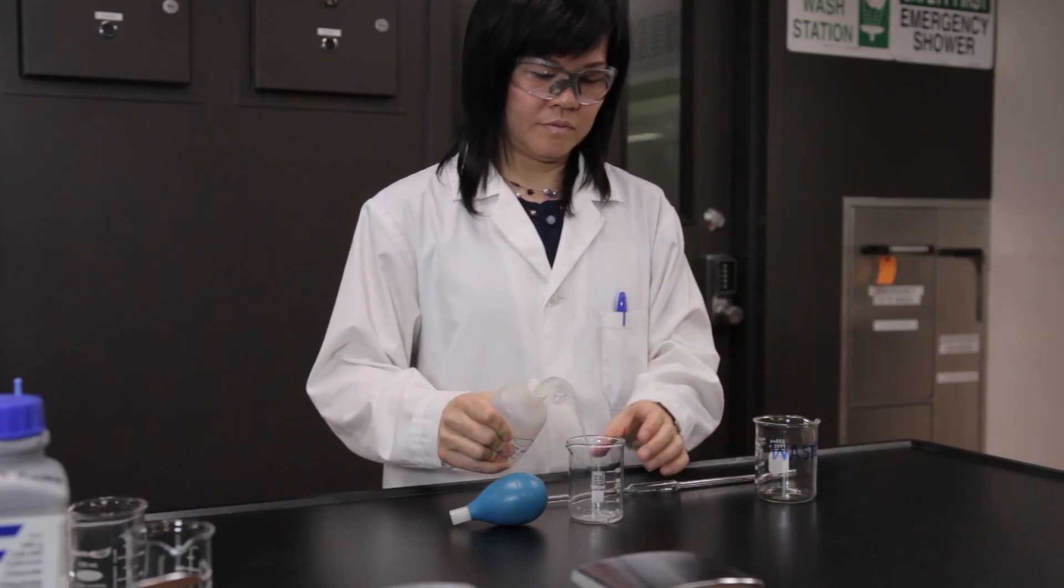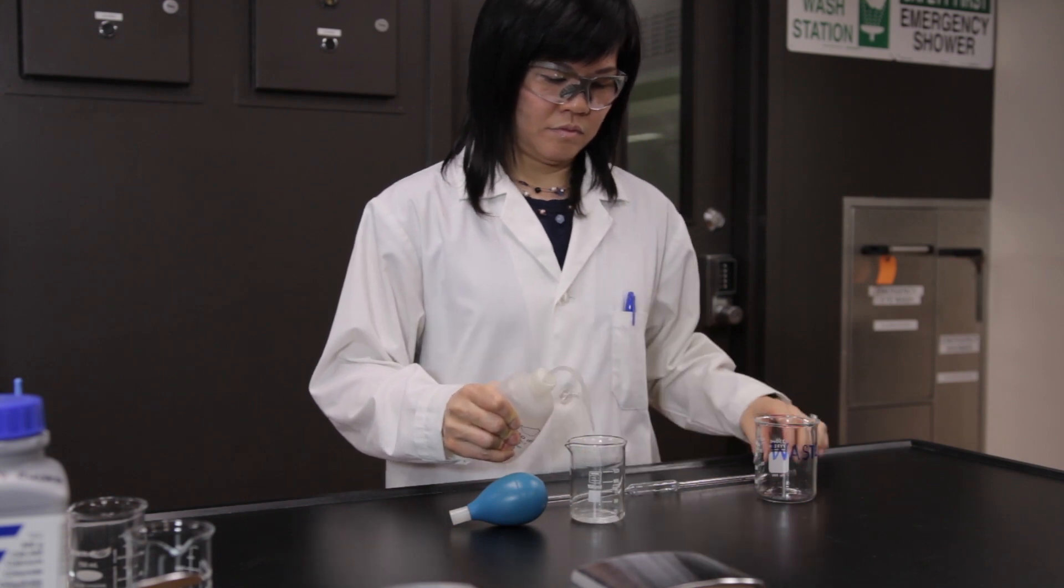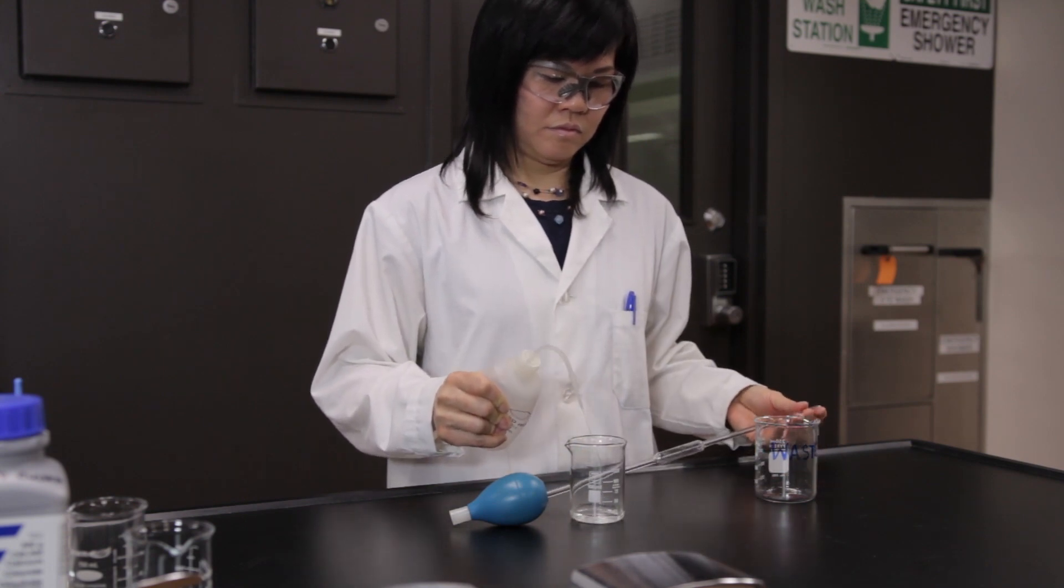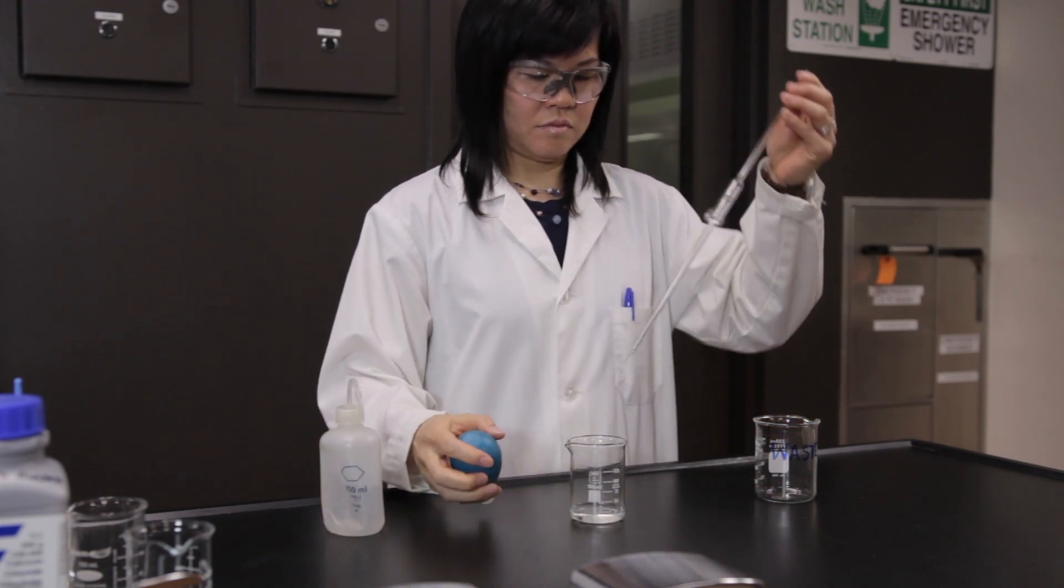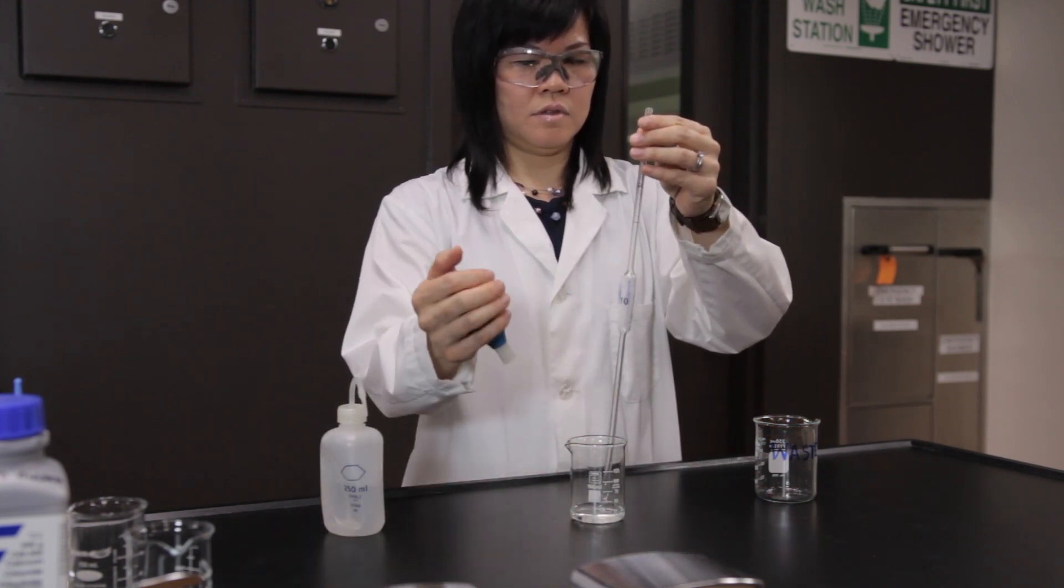Prepare a 10 milliliter volumetric pipette. First, rinse it with distilled water two times by adding distilled water into a small, clean beaker. Draw water into the pipette until it is about half full.